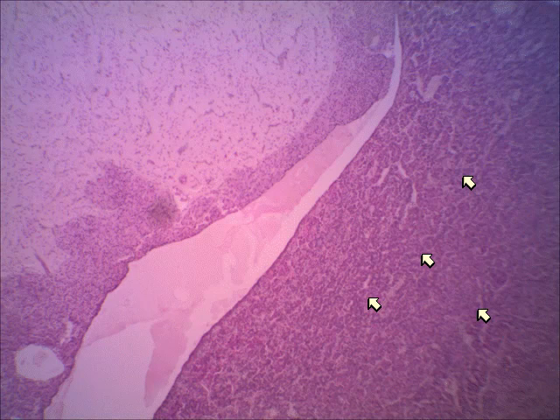You might recall from lecture, I hope you recall from lecture, that the anterior pituitary actually has secretory cells that produce various hormones, like growth hormone, prolactin. For your lab class, you do not have to know which hormones are produced by each gland. But what we're going to focus on in lab is what these look like, especially through the microscope. So again, on the right, you're seeing the anterior lobe of the pituitary. And now I'll erase these arrows. And on the left, where the arrows are pointing, you see the posterior lobe.